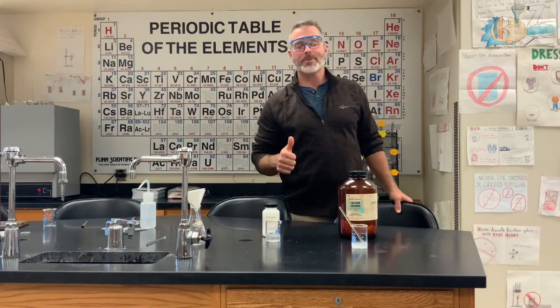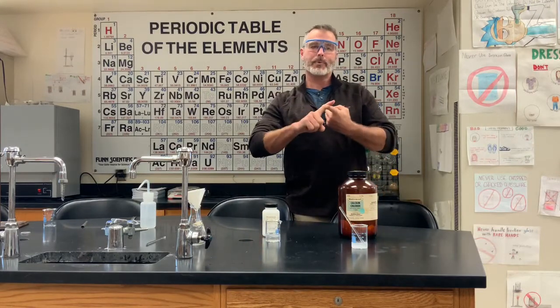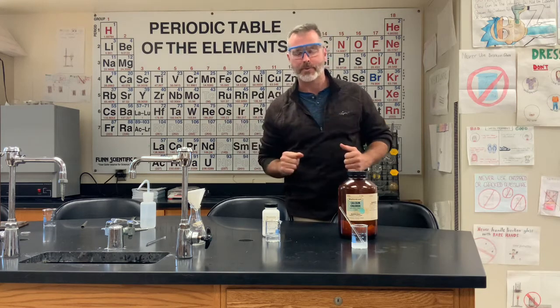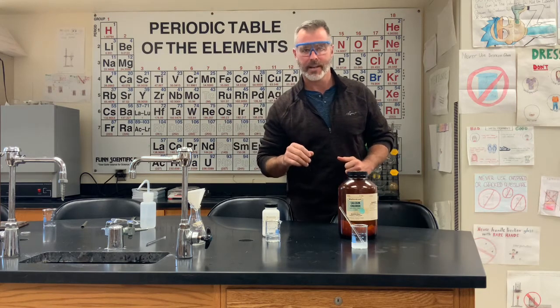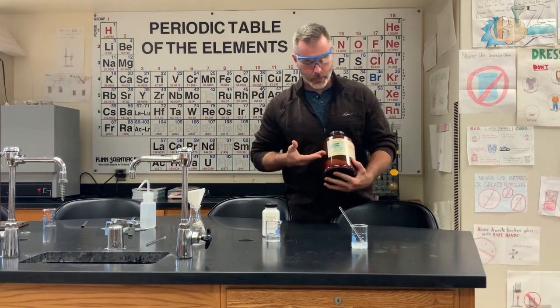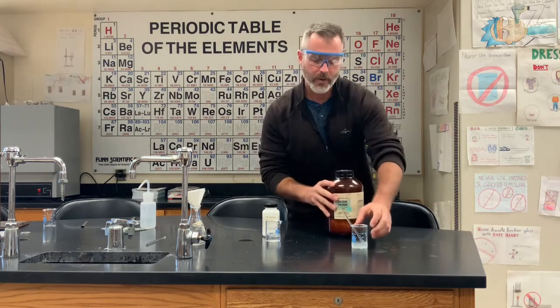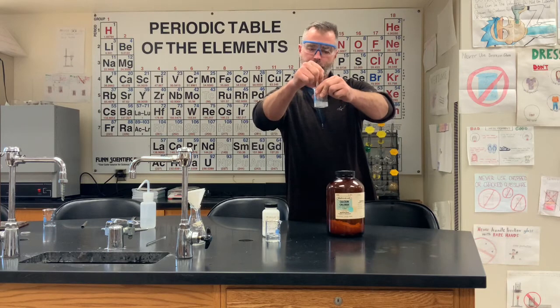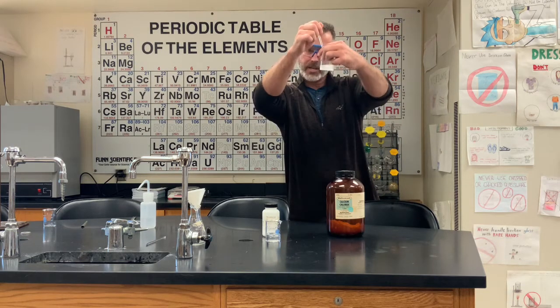First one was single displacement reaction where we had copper plus silver nitrate forming a single displacement reaction. I'm not going to tell you the answer right now of the products. This one is a double displacement reaction. In this bottle, we have calcium chloride. We've already made an aqueous solution of it. Stirred up real good, so it's homogeneous.